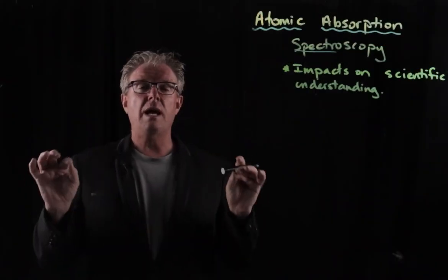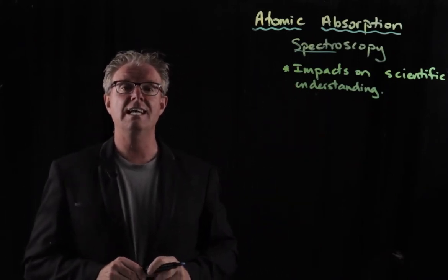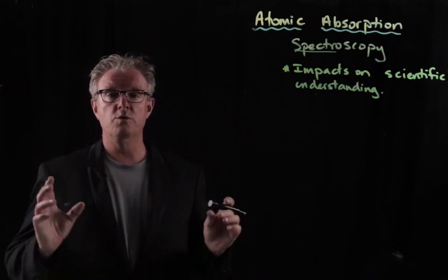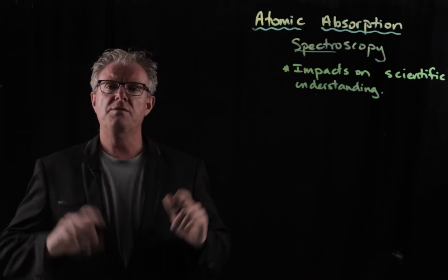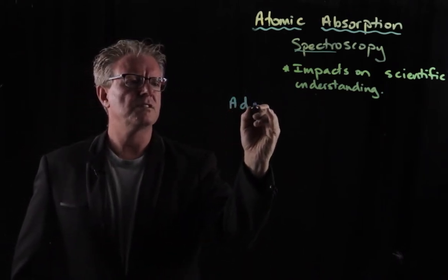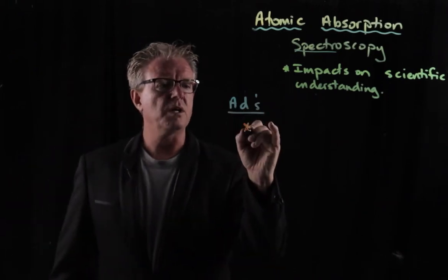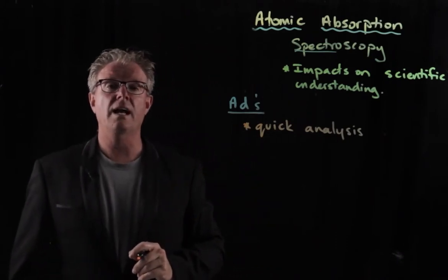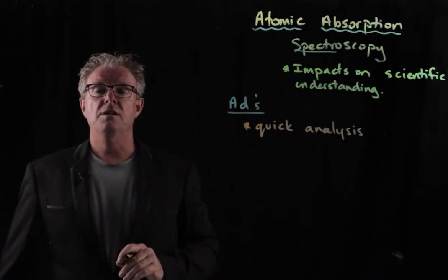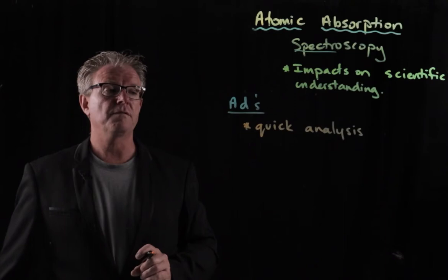Alright, in this video we're going to be having a quick look at the implications of our scientific understanding of trace elements in respect to the technique of atomic absorption spectroscopy. We've covered in a previous video the advantages of atomic absorption spectroscopy, which is the fact it's very quick. So you can do quick analysis, have multiple runs, replicate your data and get some results happening very quickly.